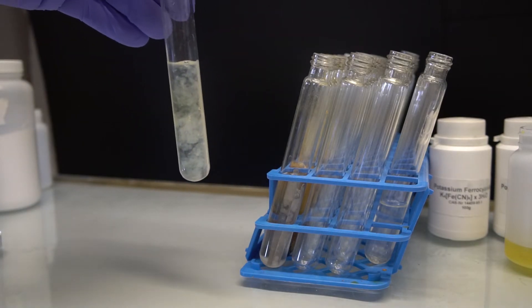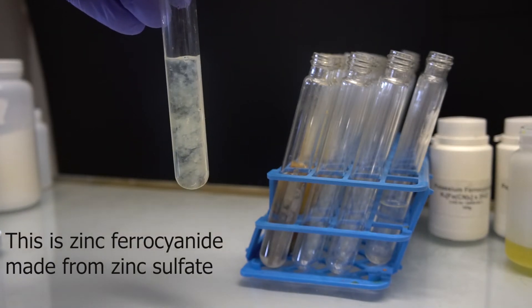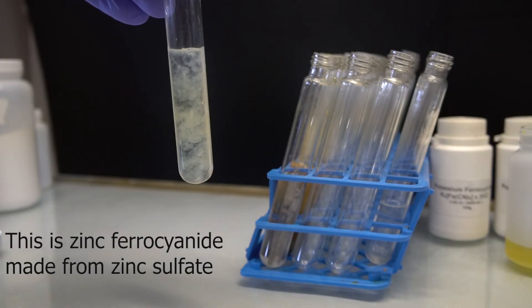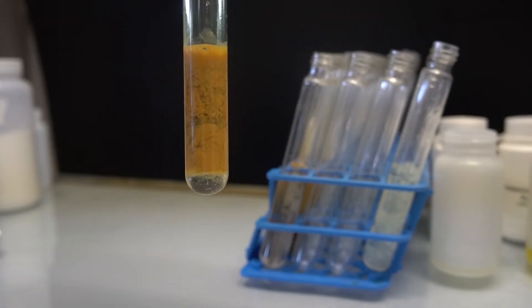Zinc ferrocyanide was off-white due to impurities in the zinc. Here you can see the zinc ferrocyanide in the test tube. Zinc ferricyanide was orangish-brown.